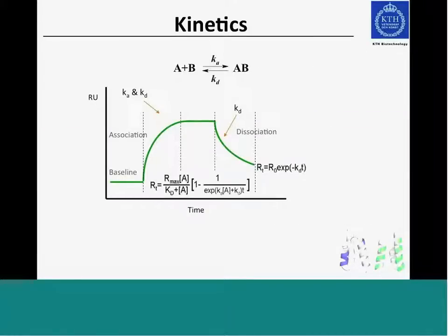And as we said already, looking at one of those sensorgrams, you start off from a baseline, you follow the association, and during the association both binding and dissociation take place. When you stop injecting the analyte, you will monitor the dissociation, and you can mathematically explain those different processes and use it to calculate the kinetics of the interaction.